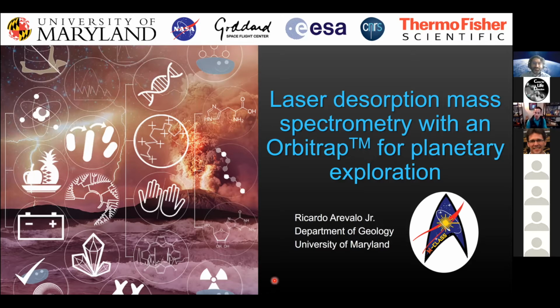I'm going to share with you some work that my lab has done. The M-Class Laboratory is a fancy acronym because I am a derivative of NASA. I spent my first 7 years of my post-PhD life at NASA Goddard Space Flight Center. M-Class is Measurement of Composition via Laser Ablation, Sampling, and Spectrometry.